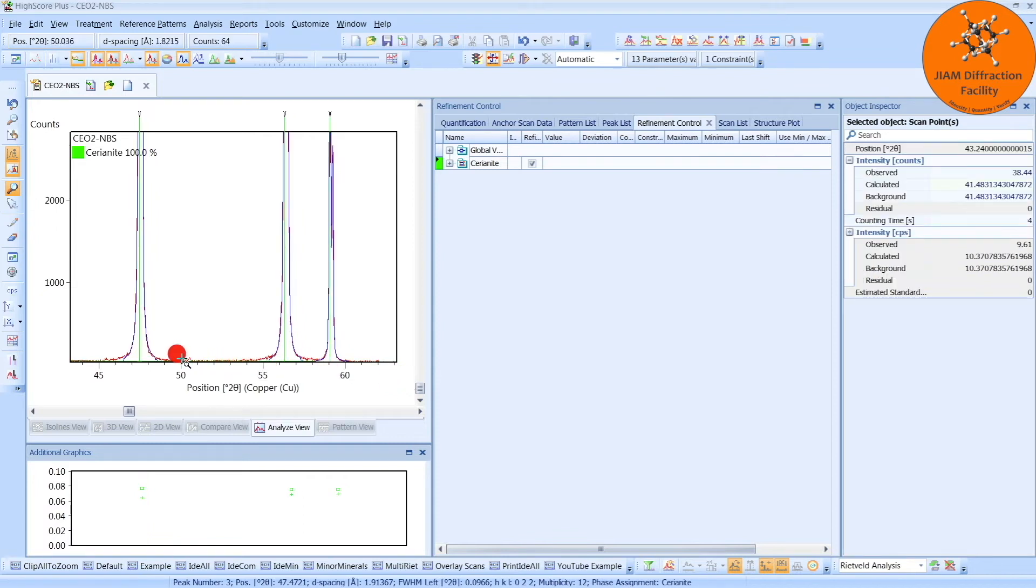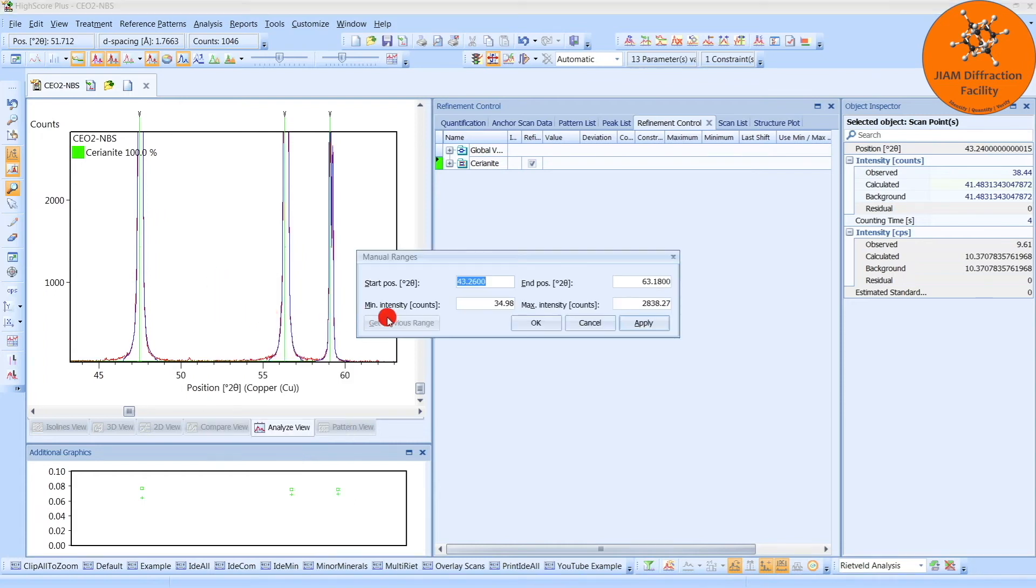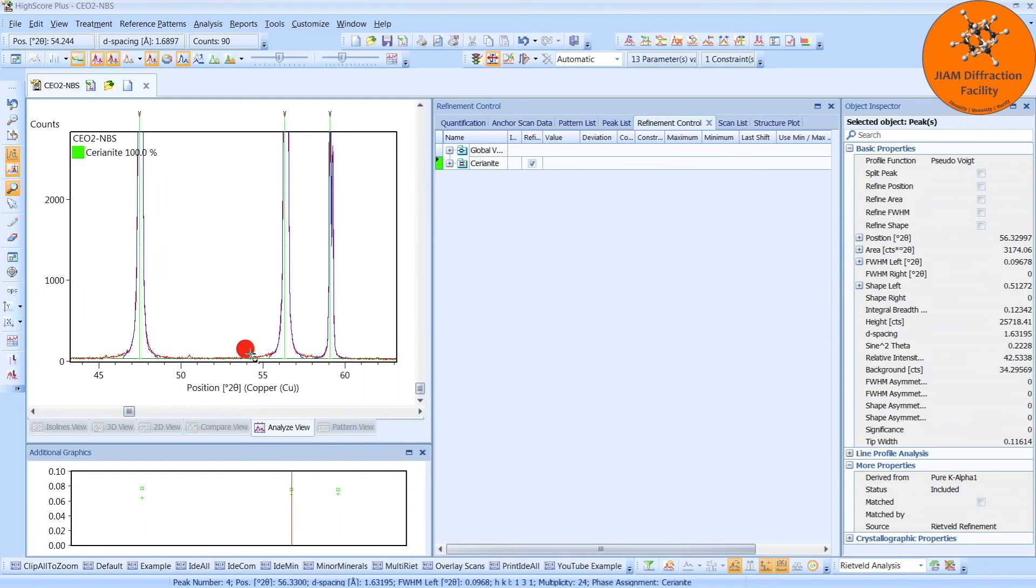Unfortunately, the data are pretty close to the x-axis. If you want to make them a little bit more visible, you can right-click, set manual ranges, and change your minimum intensity to zero. Click OK. And now we can see everything a little bit better.